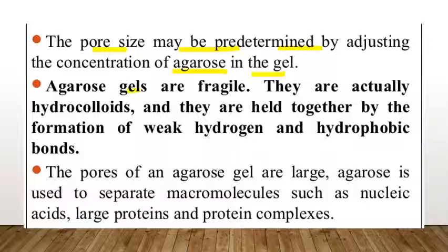The agarose gels are fragile. They are actually hydrocolloids, and they are held together by the formation of weak hydrogen and hydrophobic bonds. So their molecules are held together by the weak hydrogen and hydrophobic bonds.